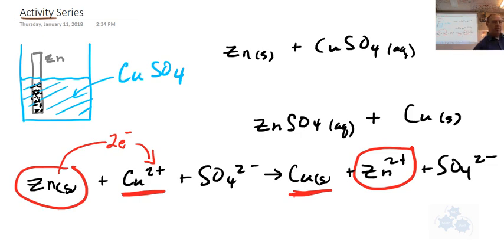And of course we have aluminum, we have the steel wool, which is very reactive. There's lots of surface area for the reaction to happen with steel wool. So it has drawn the copper out of the solution, right? The copper sulfate was a very pleasant sort of blue solution like you see here. And those ions, when they accepted those electrons, became solid, and the properties of that solution changed.